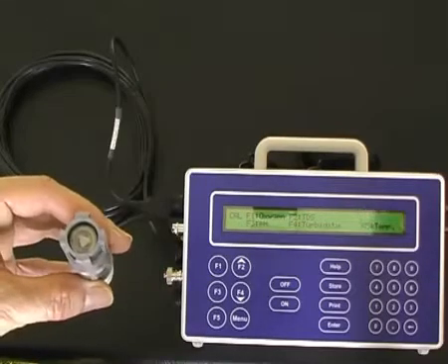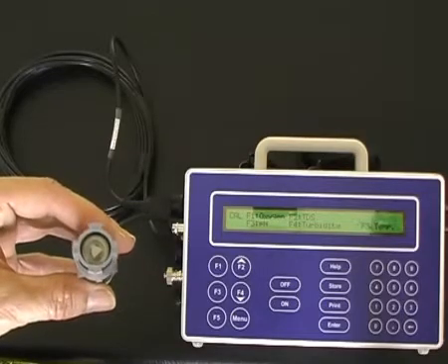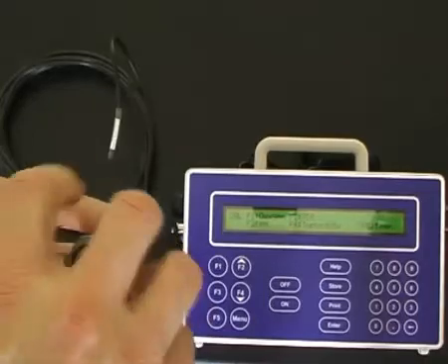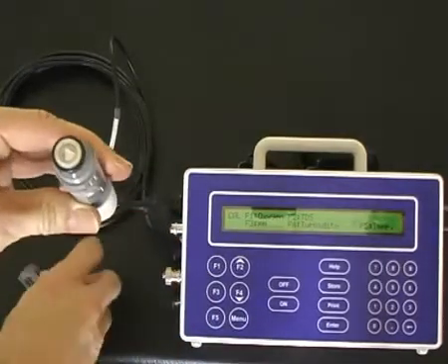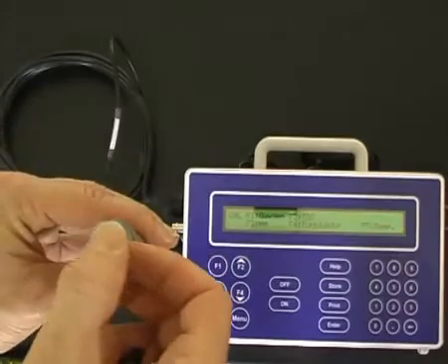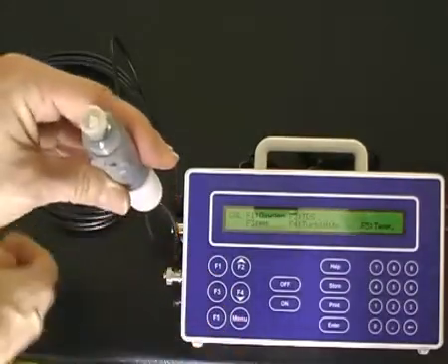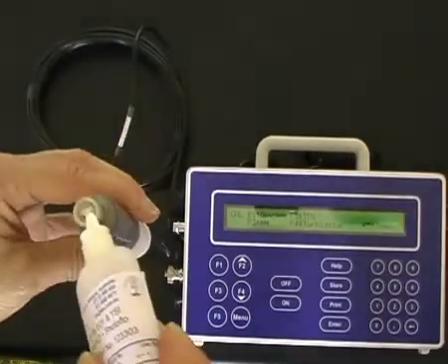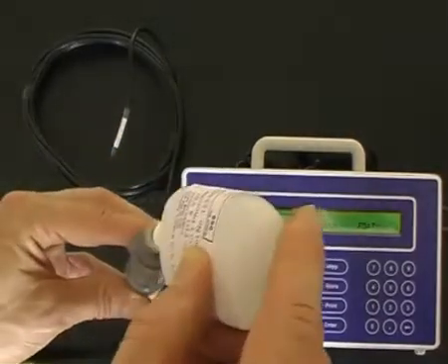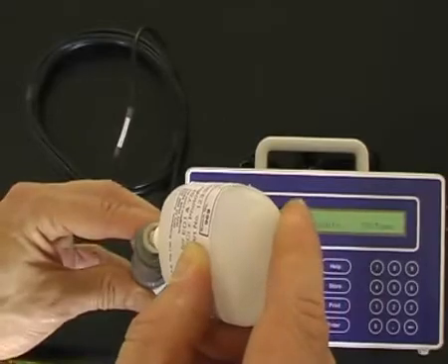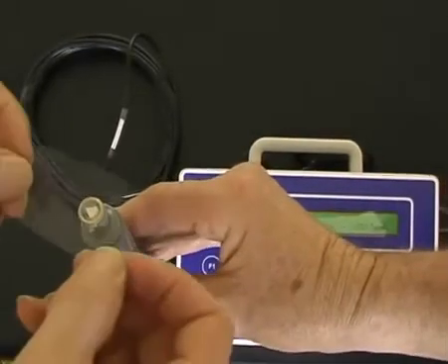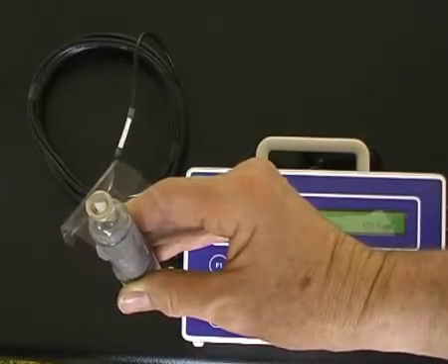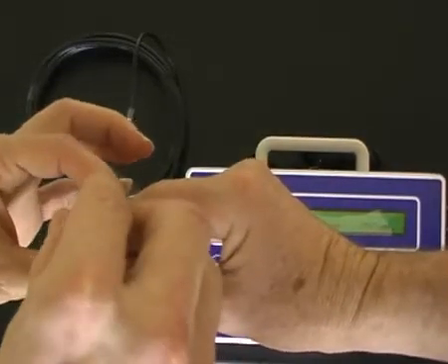The dissolved oxygen sensor must first be prepared for measurement. The guard over the membrane must be removed. The O-ring removed. The Teflon membrane removed. The filling solution must be added to the filling chamber. A membrane fitted over top. Then the O-ring refitted.